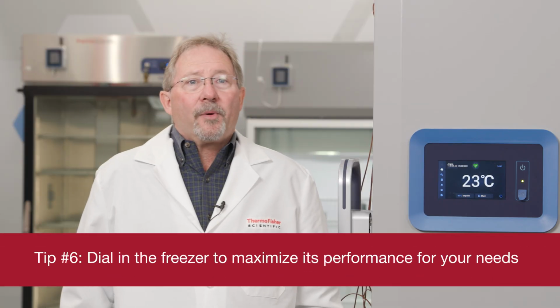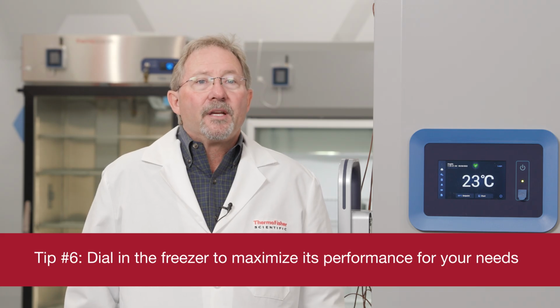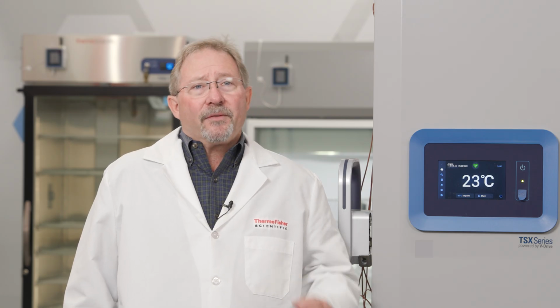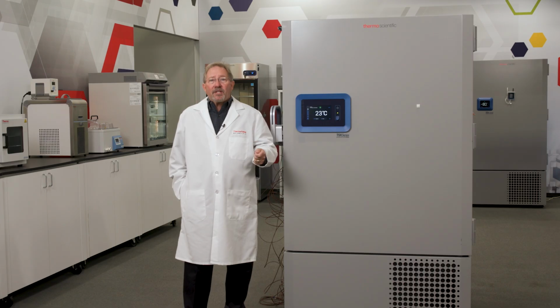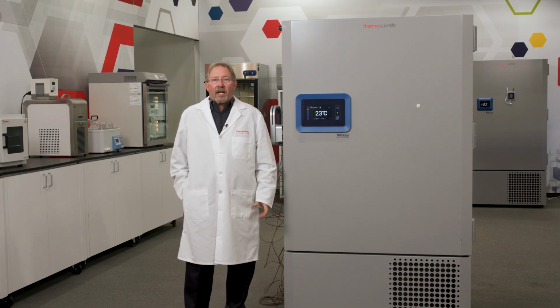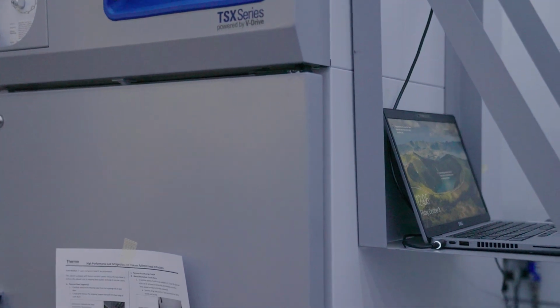Okay, our preparation is almost complete. Once the probes are attached and the freezer is equilibrated, start your testing instrument to collect a sample of a few minutes or so to see what the temperature trend looks like. Now, if the trend is high or low, just adjust the offset or set point to center the trend on your desired temperature. Collect enough information to satisfy that you are on center. This practice is one way to maximize the performance of the freezer. It will also help to avoid unnecessary test failures and can maximize your predetermined temperature alarm limits.